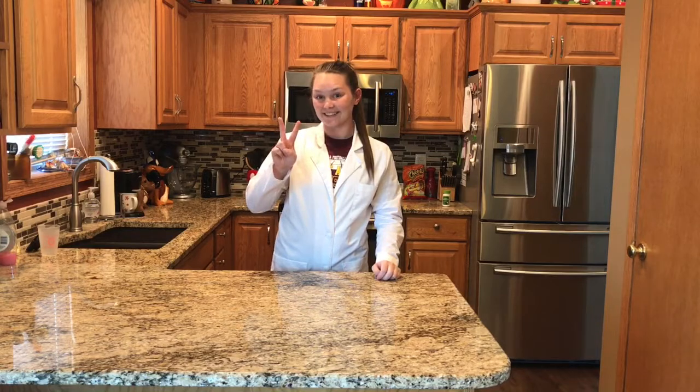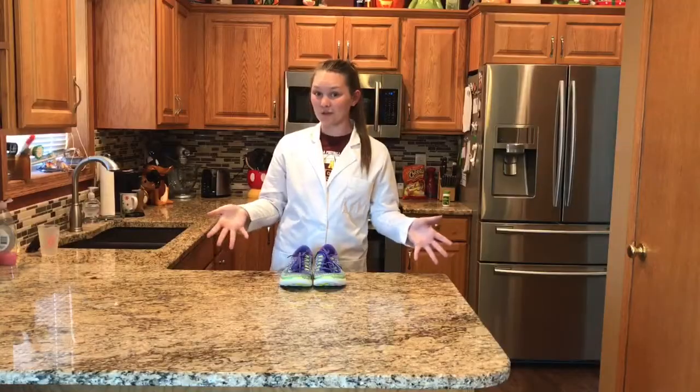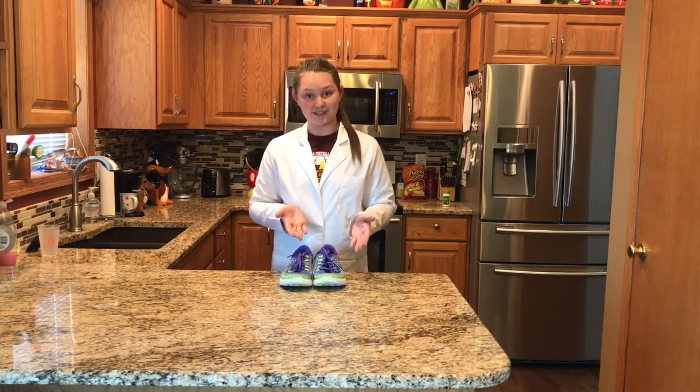First things first, keep your hair up. Keeping your hair out of your face avoids contaminating the experiment. Secondly, always remember to wear closed-toed shoes. Closed-toed shoes prevent the experiment from being spilled onto your feet and damaging the skin.